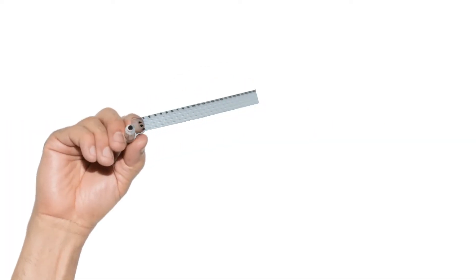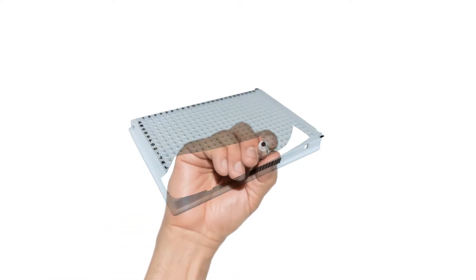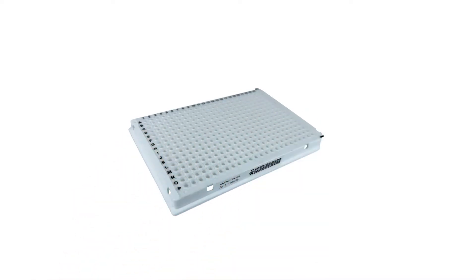We can provide these primers and probes in pre-plated 96 or 384 well plates direct to your laboratory.